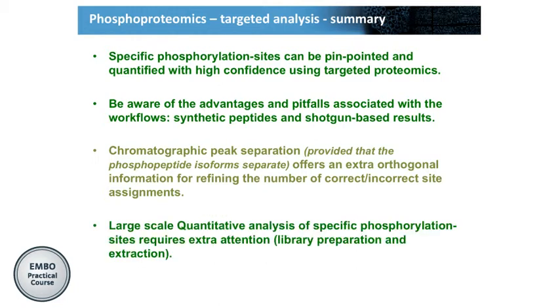And when we do these on a large scale in SRM, maybe we can order 1 or 2 or 3 peptides when we're working with specific proteins. But when we go to SWATH type of applications, when we have thousands of these sites across many runs, we really need to be extra careful in how we build our library and how we take into account retention time so that we don't make these mistakes and carry them over many, many files and runs and get an incorrect data set. Exactly how to do these steps, to some extent Ludo will discuss, and some of it is still under development, but I just want to bring to your attention in this talk that this is a critical issue that you need to take into account right from the start.